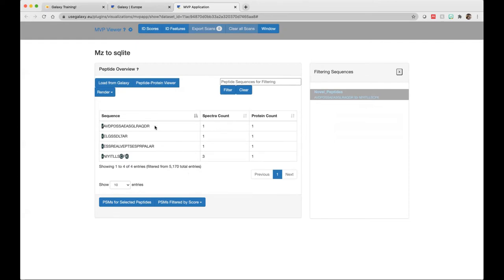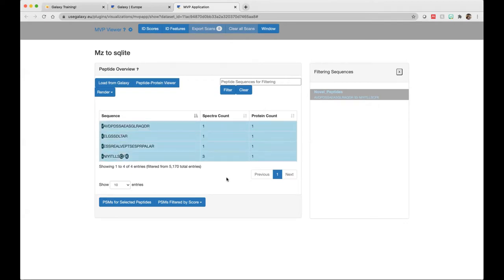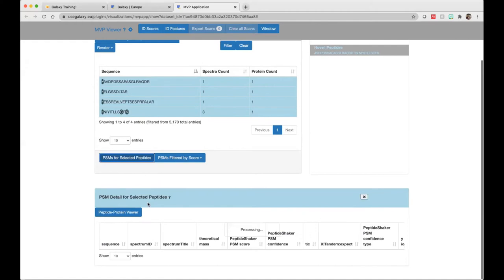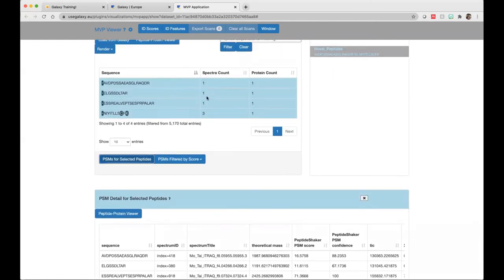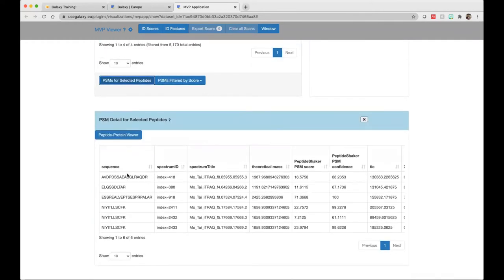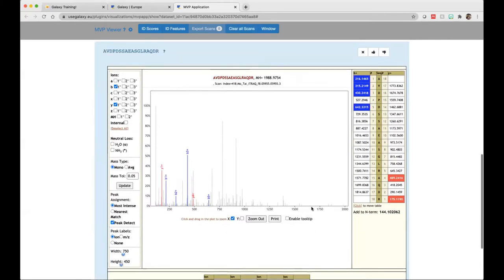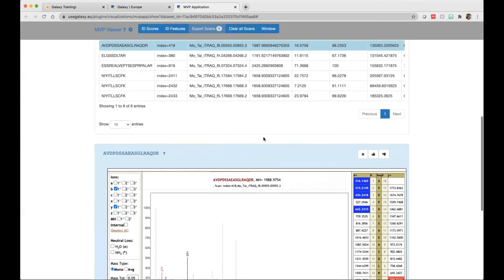The second step is to look at the spectra — the PSMs involved with these sequences. I can select one by one or select all at the same time. For the purpose of the tutorial, let me select all and show how the PSMs look. Select 'PSM for selected peptides.' I should be getting six spectra. The first thing I want to do is look at the spectrum quality. This is a Lorikeet viewer, which gives information about the spectra clicked: the peptide information, the file it came from, and the theoretical mass — all the information present in your PSM report.